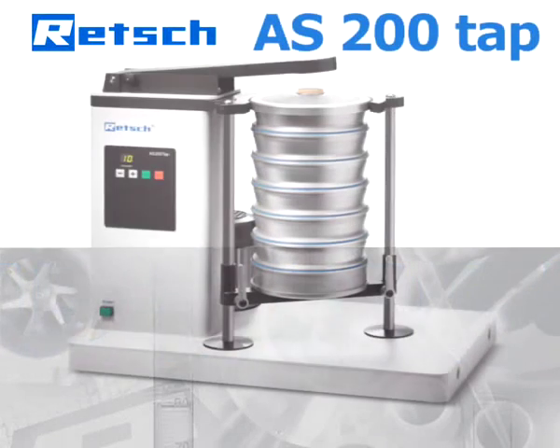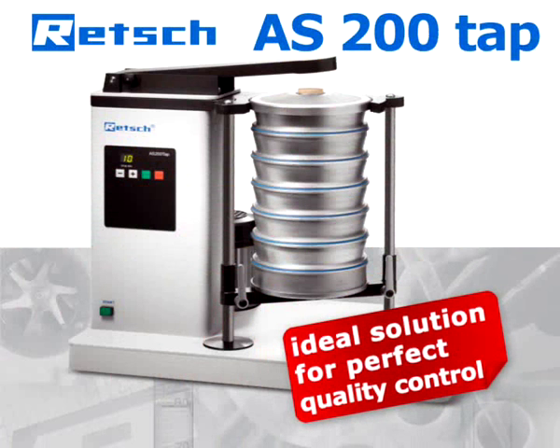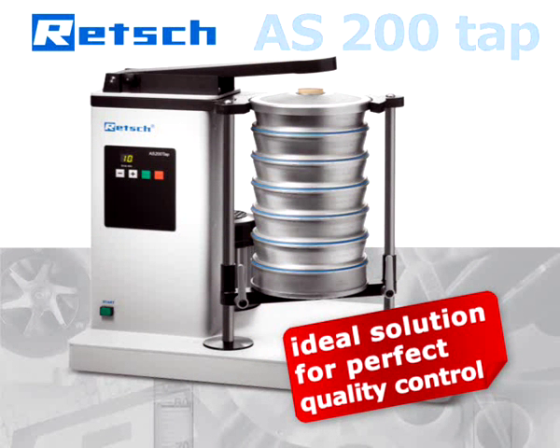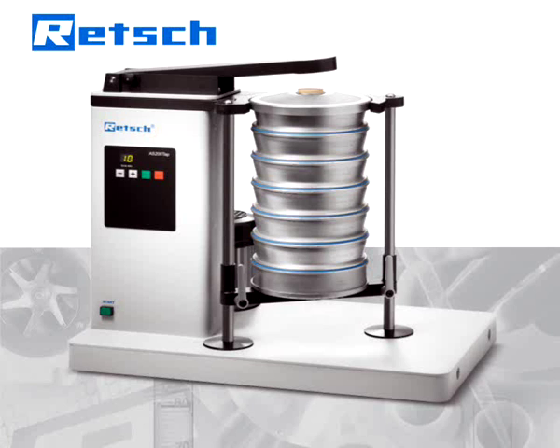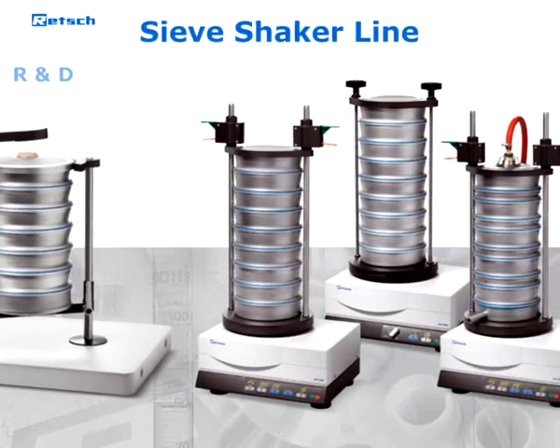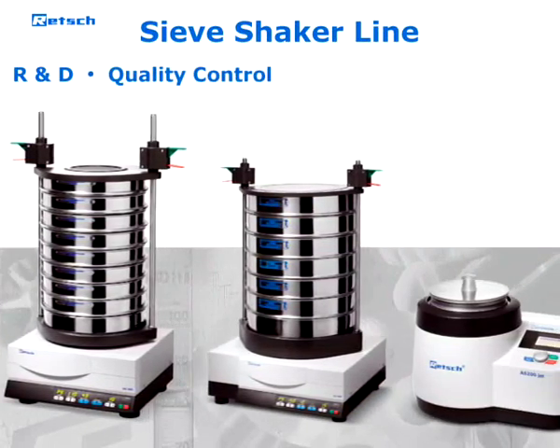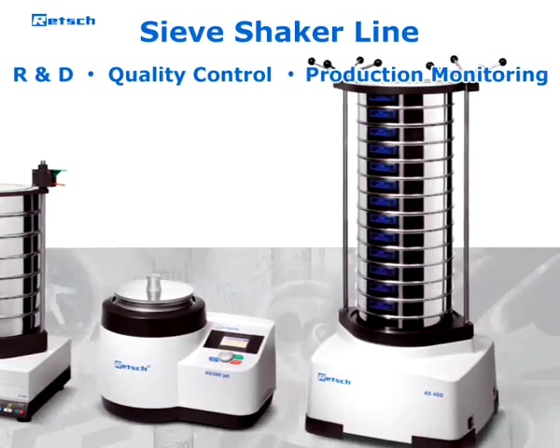This approach makes the TAP sieve shaker AS200 TAP the ideal solution for perfect quality control. The AS200 TAP is part of the Wretch sieve shaker line, which has been used in R&D, quality control of raw materials, intermediate and end products, as well as in production monitoring for many years.